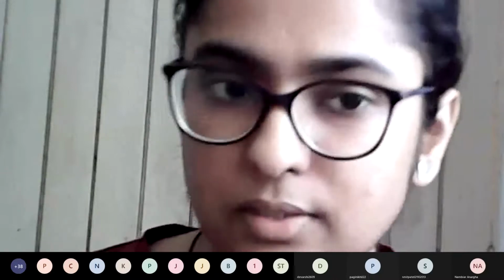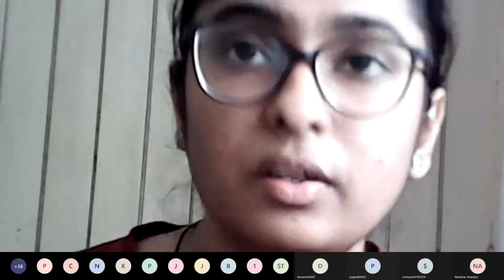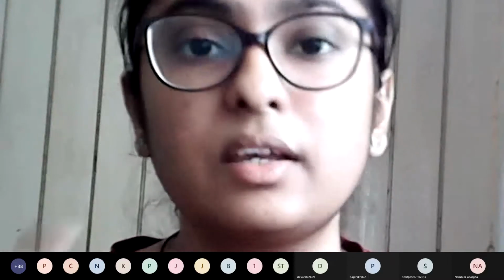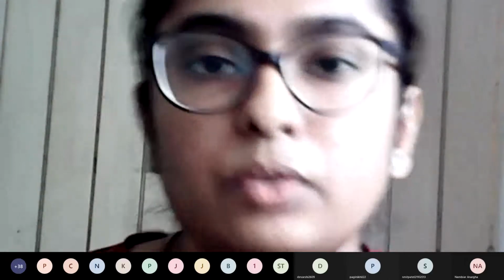Whatever reading you get when you have this color change of when you put hexamine, and the second step that I said, whatever reading you get, that reading tells you the amount of zinc present in your sample. Only zinc, exclusively zinc. We will look at the calculations also how that is being done. But yeah, let me tell you about the color change.